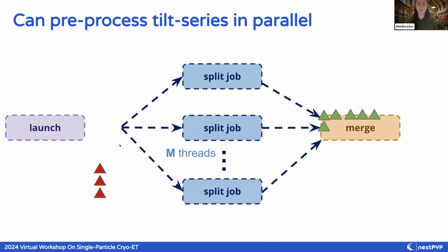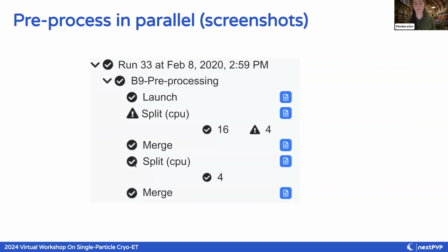Once the queue is completely done with the original jobs, it's going to put the failed jobs back in line to reprocess those. So now the failed jobs are back in line since all the other jobs were successfully completed, and they're going to go back to my split jobs, get completed, they all worked this time, and now we're done. This is a visual of what that'll look like in your jobs panel.